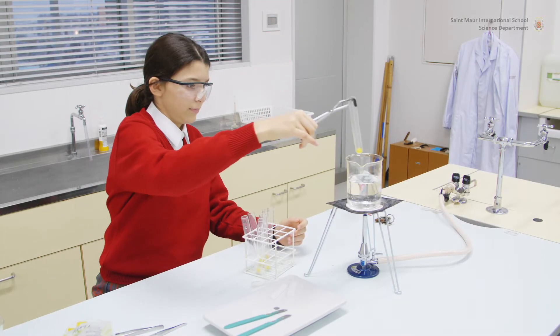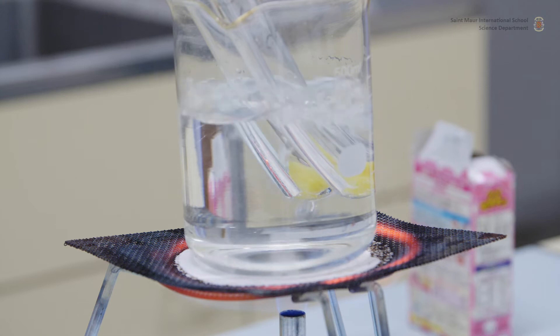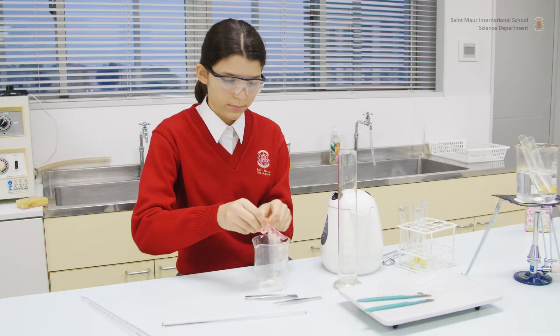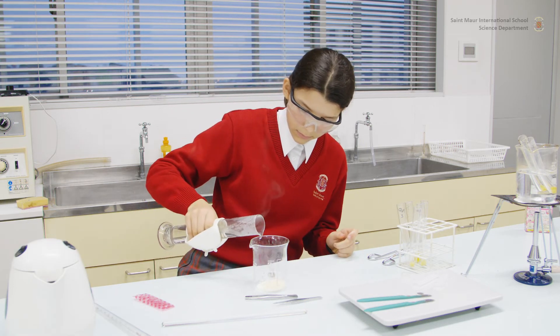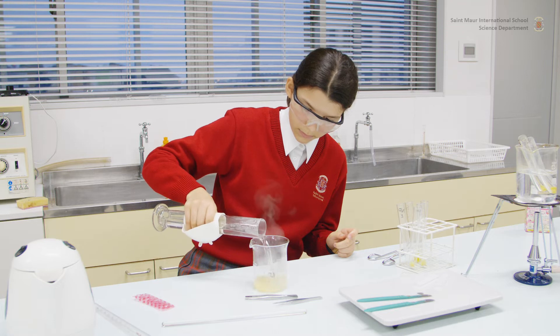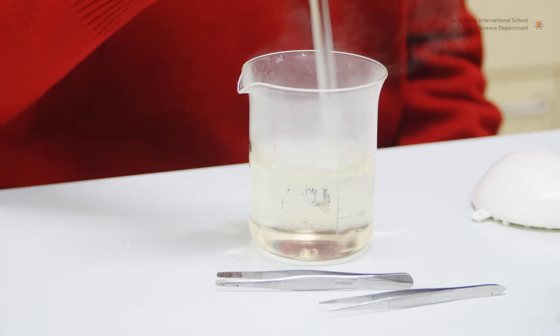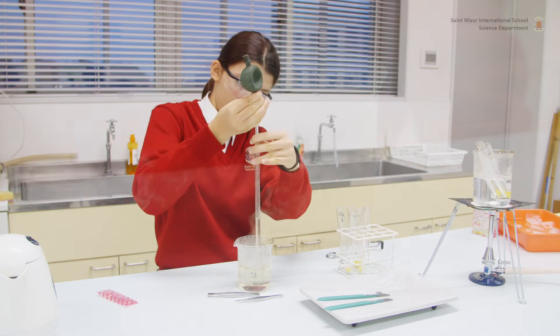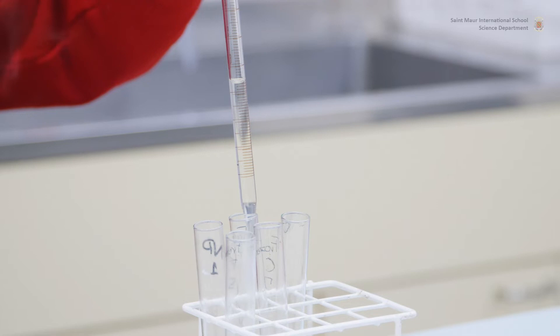Place one tube containing fresh pineapple and one tube containing canned pineapple in a boiling water bath for five minutes. Meanwhile, prepare the gelatin by adding one packet of powder to 200 milliliters of boiling water. Stir well. Pipette three milliliters of liquid gelatin into each of the seven tubes.